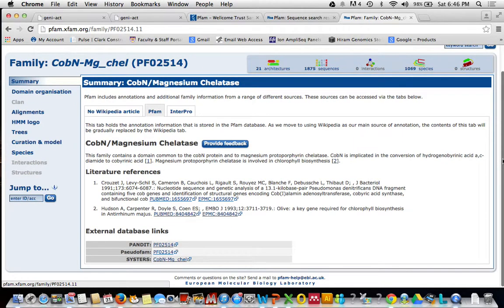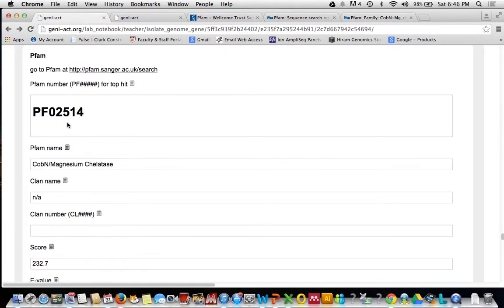Scroll down. And this should be your PFAM number. So PF is PFAM, and this will give you your PFAM number. So let's go back, and this is your PFAM number. This is your PFAM name.